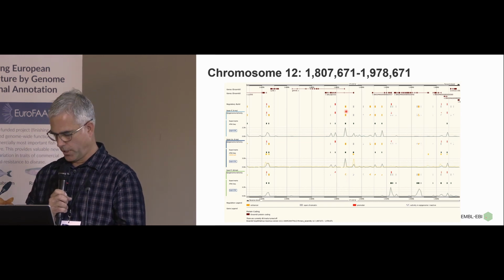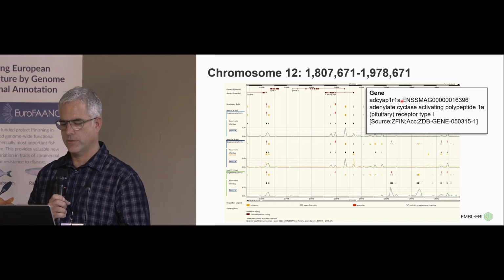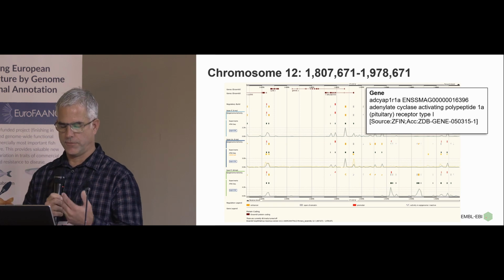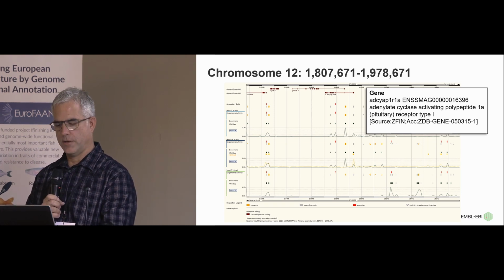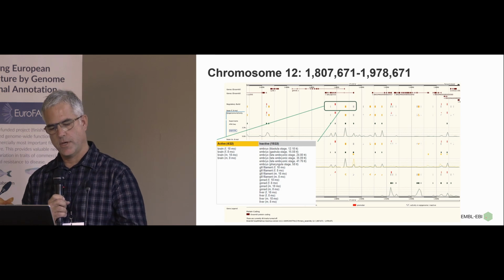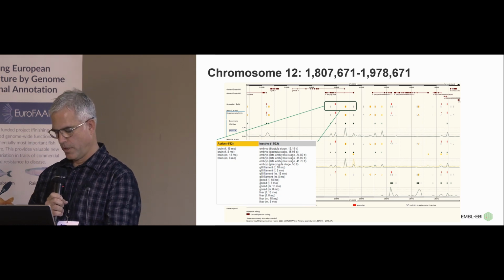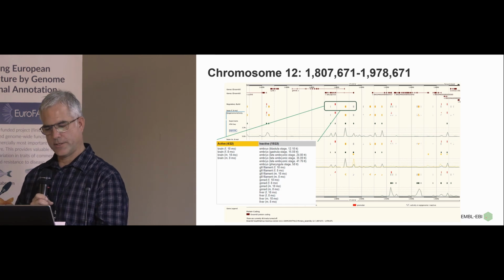Now, if we look at the actual gene that it's falling within, it is related to brain, at least by homology. And so this gives you some indication that probably you're finding something of interest there. And in fact, if we look at this cluster of regulatory features, every single one of them is coming through as brain-specific and not occurring in other tissues. But I want to also show you some things that are not quite as clear-cut.